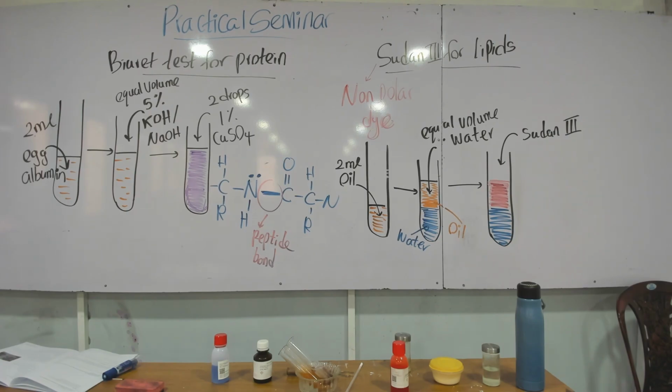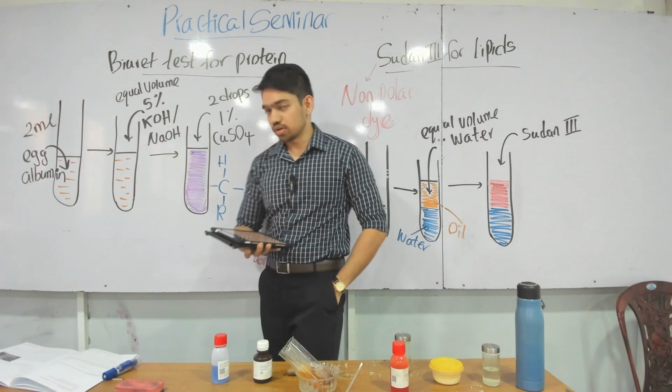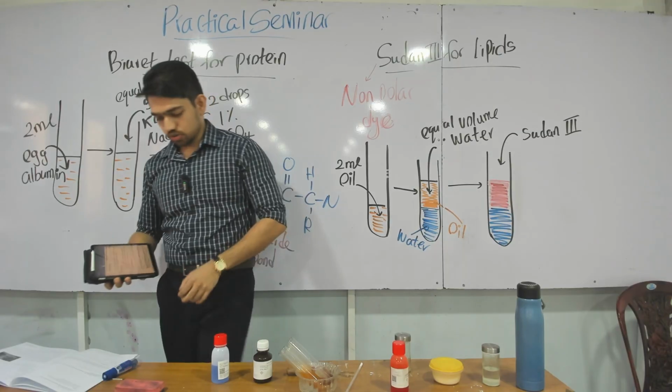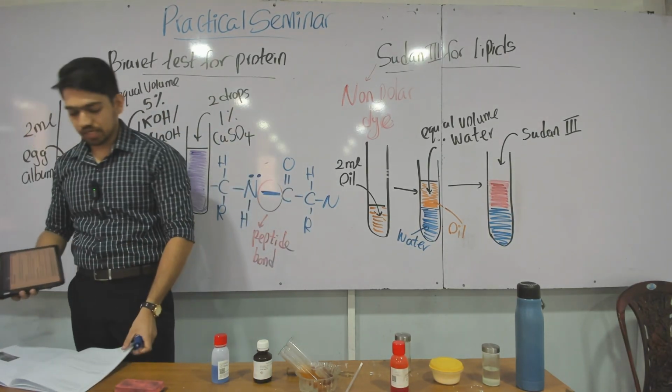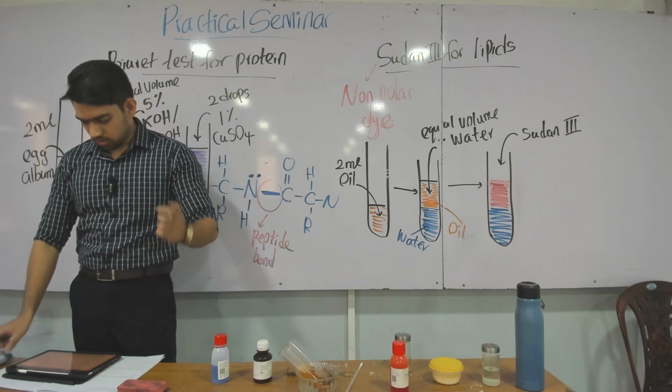Advancement of cytology is mostly based on microscopy. Discovery and early study of cells progressed with the invention of the microscope. Sort of introduction things. Light microscope. So we are mainly focusing on the light microscope and another form called the electron microscope. Light and electron microscopy, we are going to mainly focus on.